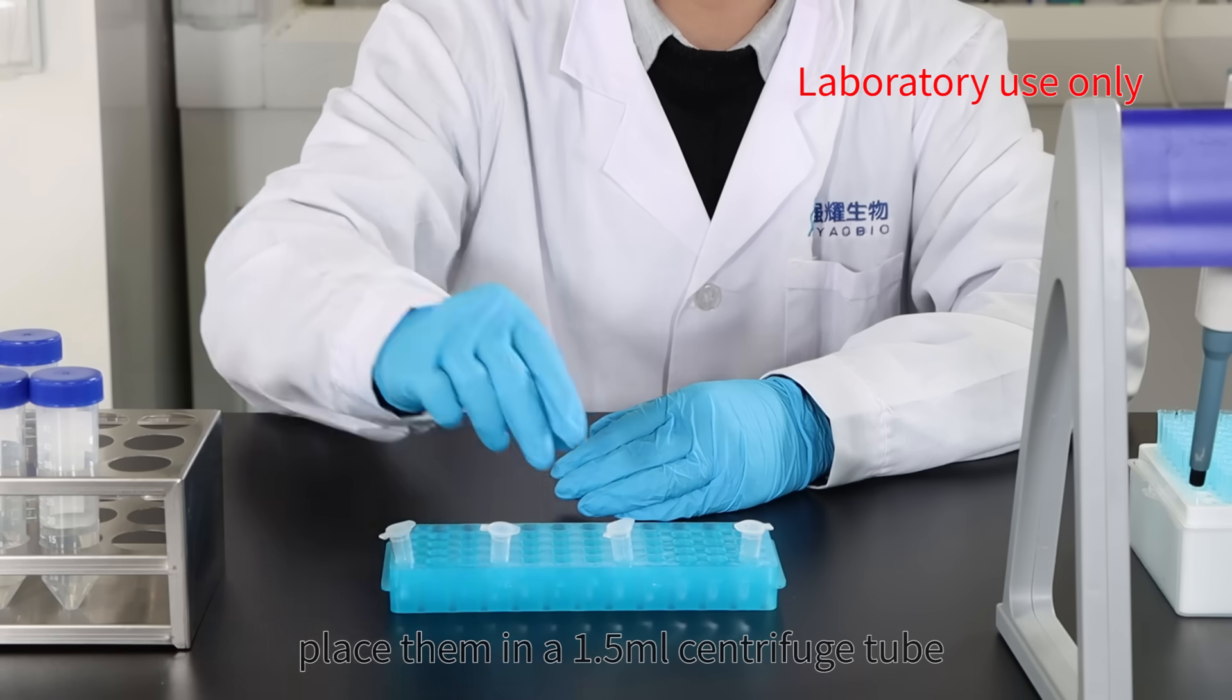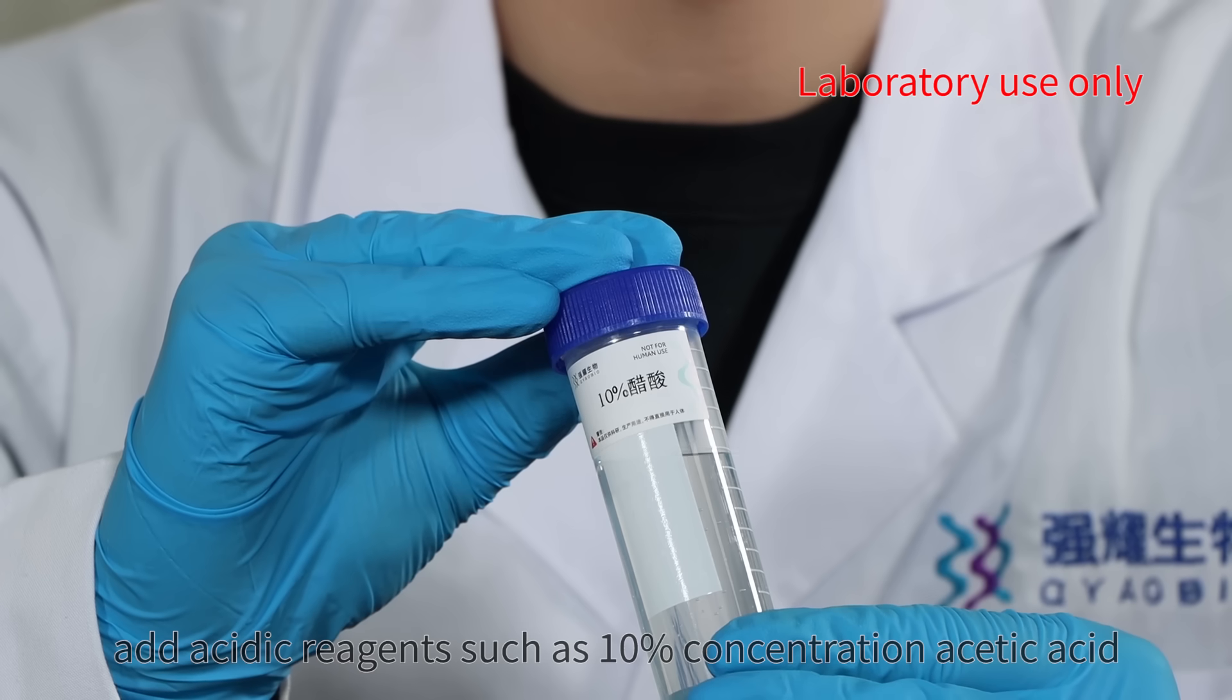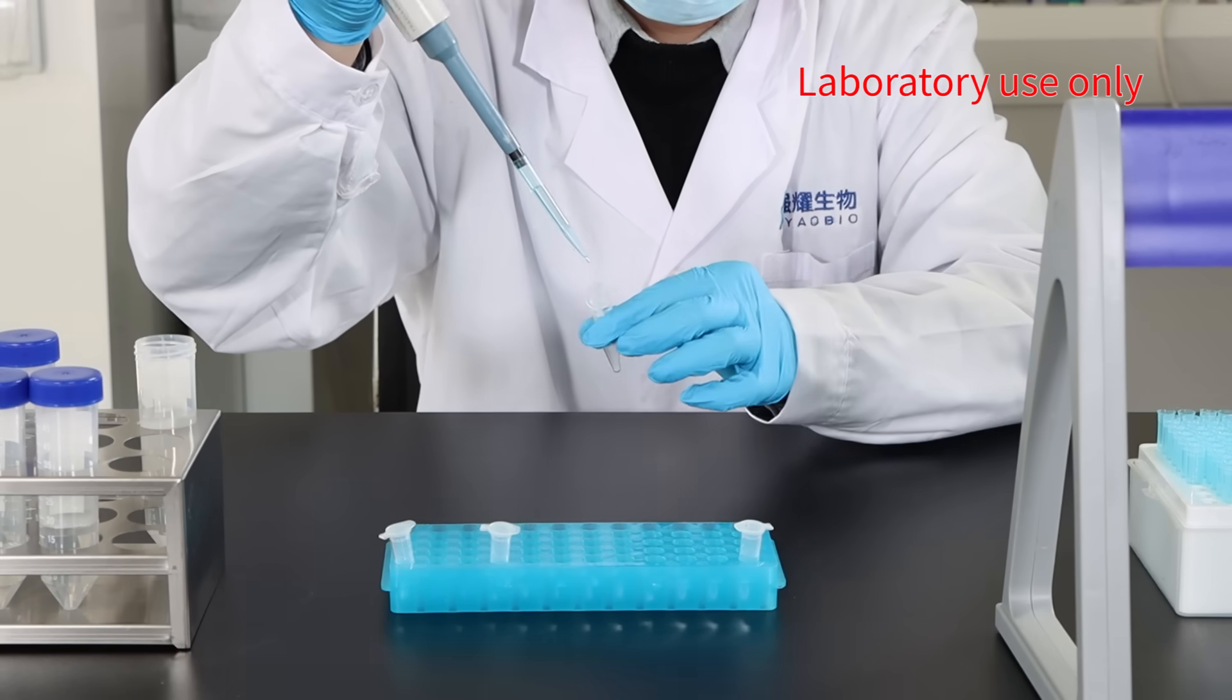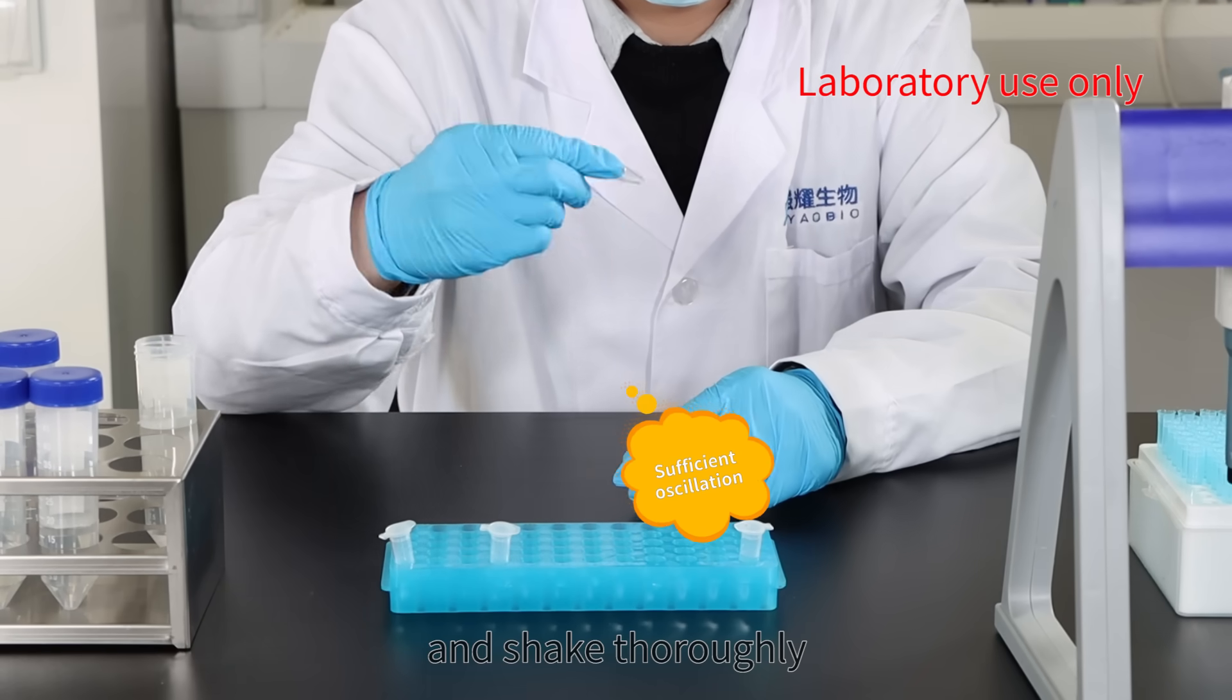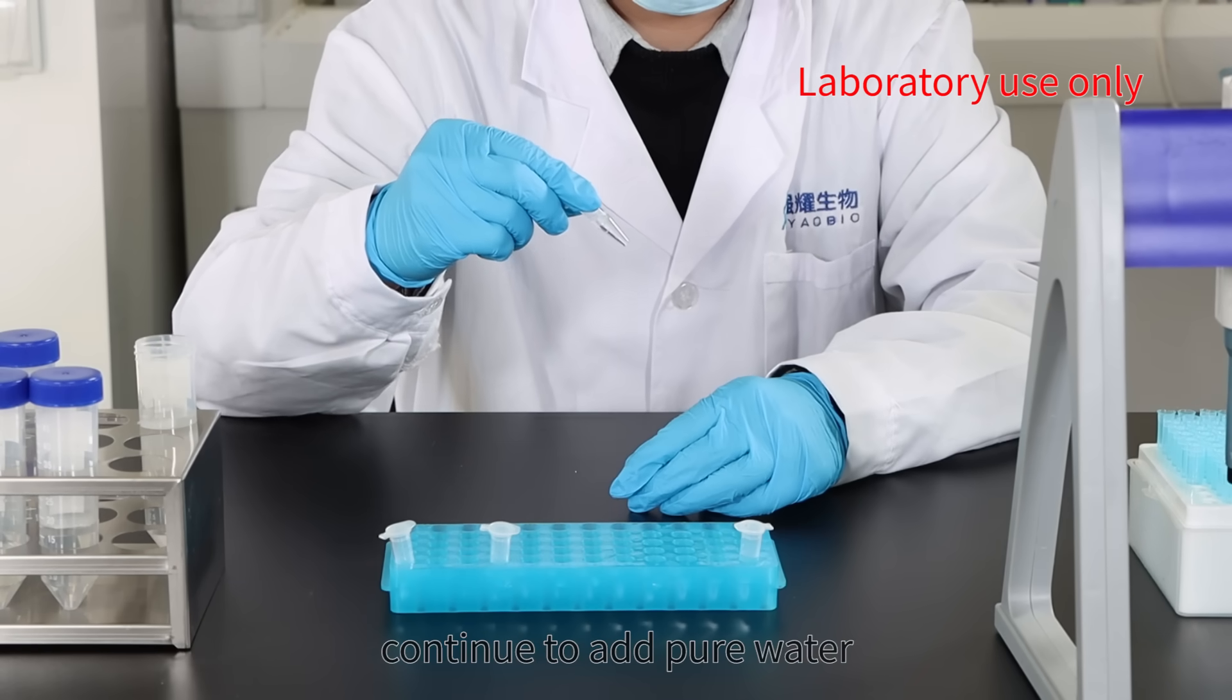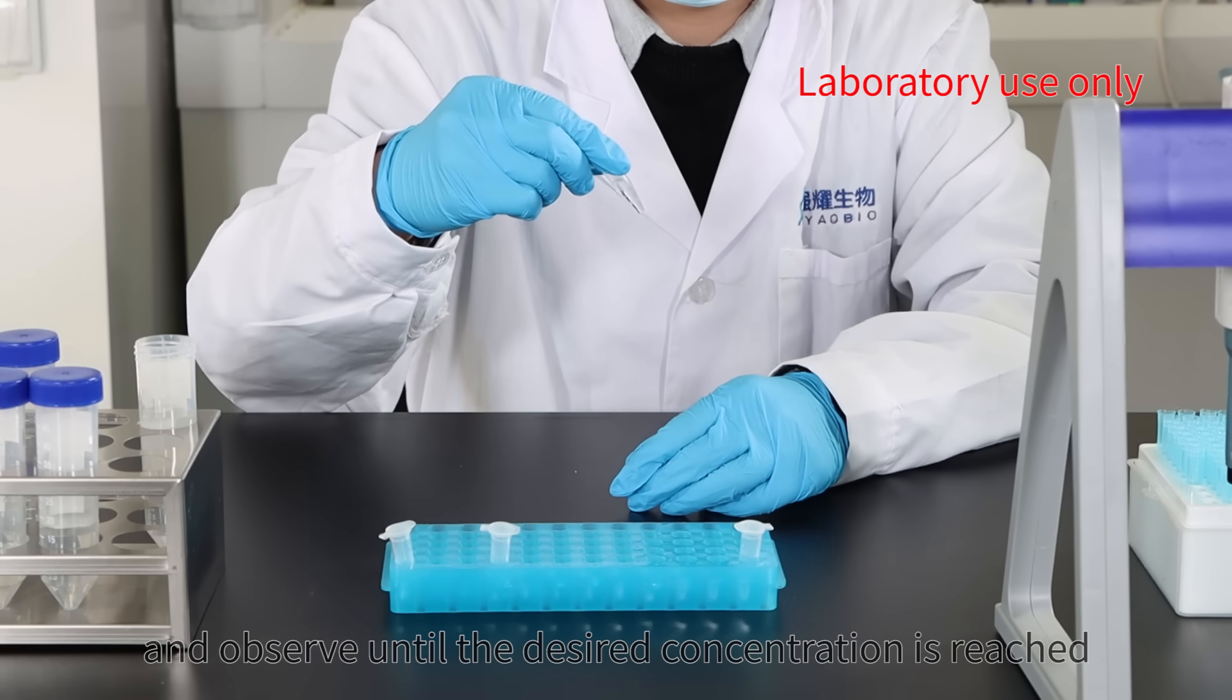Two, regarding alkaline peptides: select a standard amount of peptides, place them in a 1.5 milliliter centrifuge tube, and add acidic reagents such as 10% concentration acetic acid. Shake thoroughly. After dissolution, continue to add pure water to continuously dilute and observe until the desired concentration is reached.